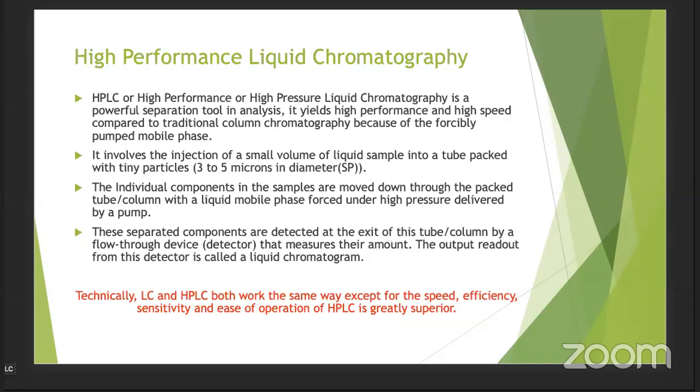Now, technically, LC, that is liquid chromatography, and HPLC both work in the same way, because HPLC is an advanced version of LC only. You just have to apply a high pressure. The enhancement it gives you is speed, better efficiency of separation, high sensitivity, and ease of operation.